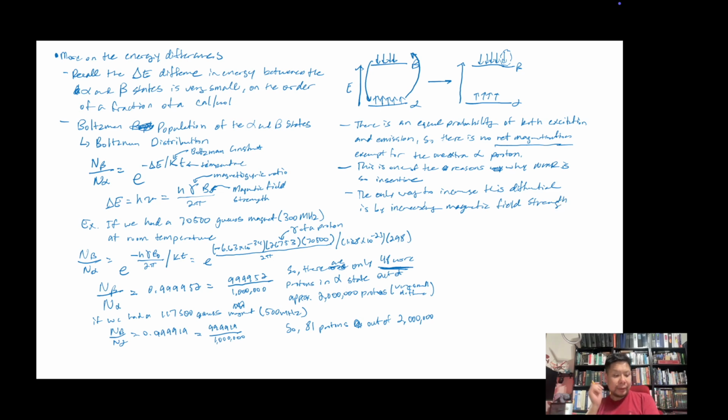And again, the biggest instruments we have these days are in the 1 to 1.2 gigahertz range. They're rather huge. These instruments are literally pushing the limits of what NMR can do with electricity, the limits of physics, and resistance and conductivity. And so that's why these things have to be so big and they're so cold and stuff like that, right?